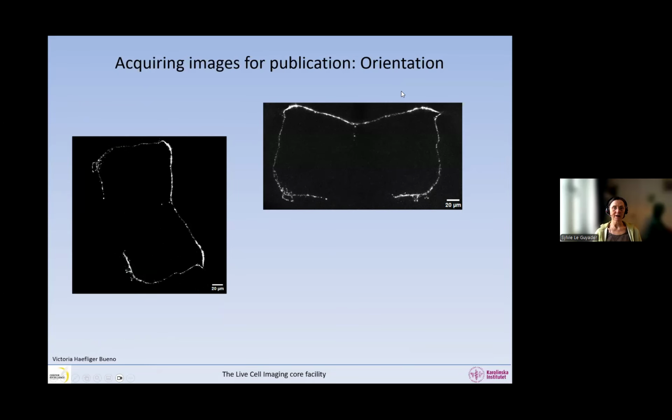So here we have, for example, an image that I stole from Victoria. This is fresh from yesterday. And you can see in here that these pixels look saturated. This nerve goes up and down, let's say, and you have a different intensity throughout the whole thing. But it is in here. I could have done a better job by changing the gamma instead. I think I will do that, but I need to ask first, Victoria, if I'm okay.